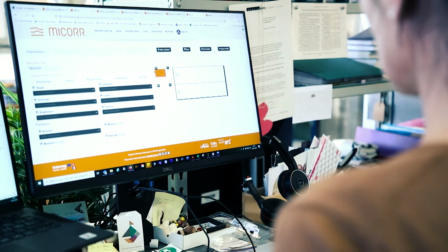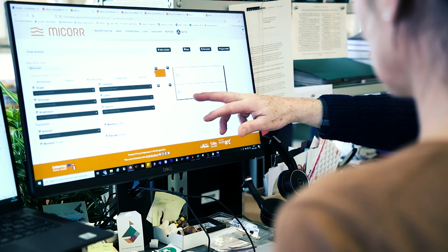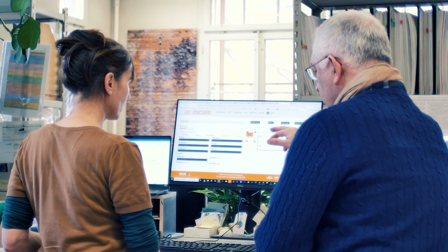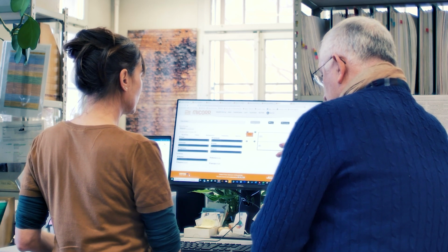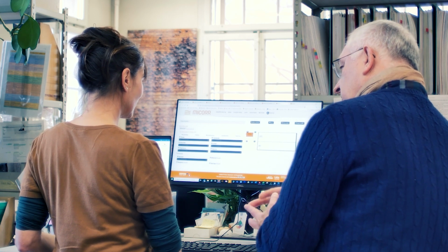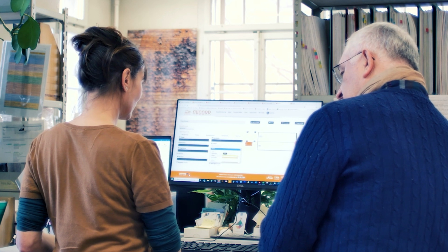So here we start building the structure. We have the metal, you have seen, and the first corrosion layer. There will be more. So now you are starting building it. You have now to inform each stratum with what you have seen under the binocular. So the color, whether it's hard, whether it's cracked.